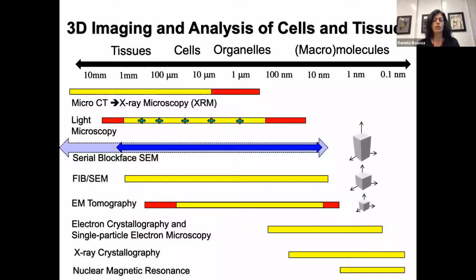And in order to achieve the 3D imaging and analysis of biomolecules of interest in their cellular and tissue context, we take advantage of various imaging platforms which can give us specific information. For example, with light microscopy, we can observe the dynamic behavior of proteins via time-lapse imaging. And with the latest advances in the field, one can push the boundaries in terms of obtainable resolution. By doing correlative microscopy and taking advantage of other platforms like tomography, serial block face scanning EM, or X-ray, one can navigate across multiple modalities following molecular constituents across scales.